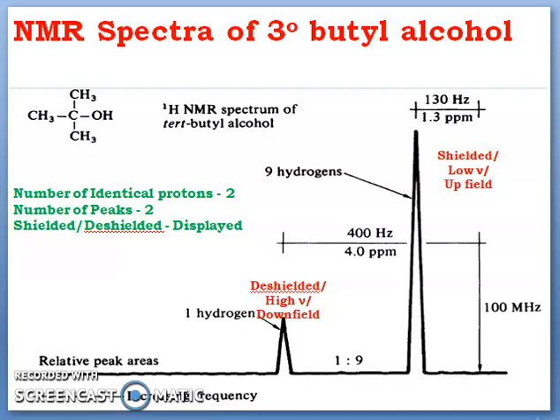In this context, let us discuss two NMR spectra of two different compounds. One is aliphatic, another one is aromatic. With that, you can understand how one can interpret the NMR spectra of organic compounds.